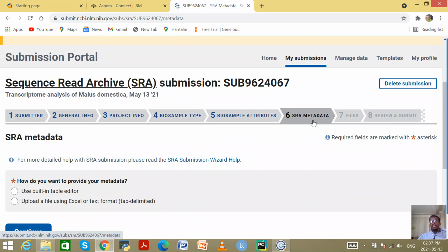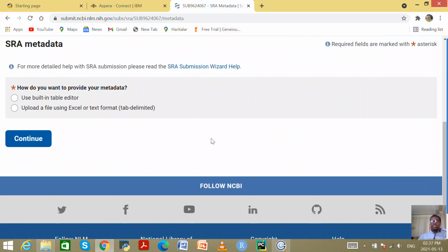So now we have to click SRA metadata. You can upload SRA metadata in two ways. The first way is to use the built-in table data editor, where you write and fill in the data online on the site, like we'll do now. The second one is to upload a file using Excel or text format.